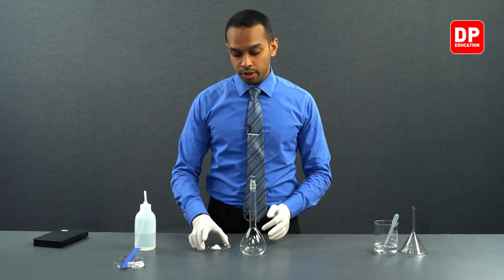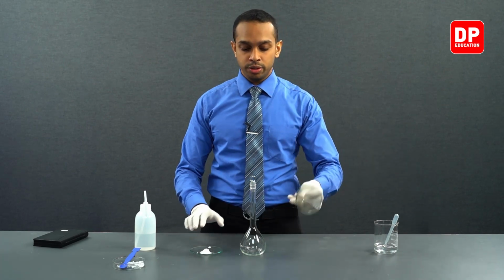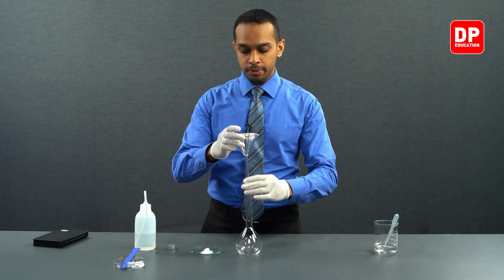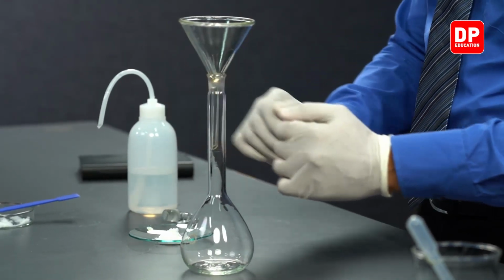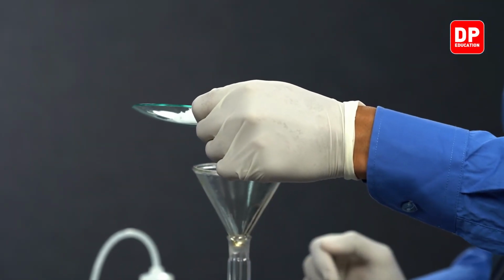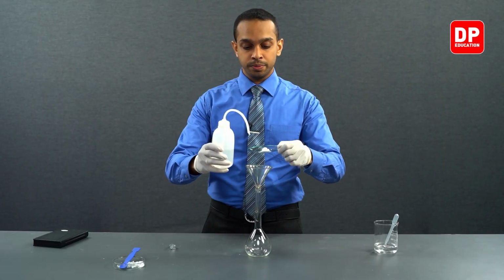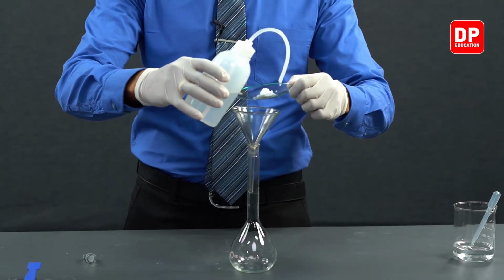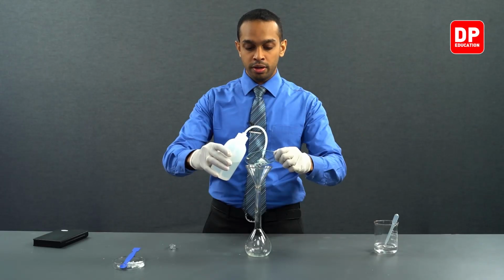To transfer this solid completely onto this volumetric flask, we will be using a funnel. We will open the volumetric flask, remove the stopper, and place the funnel on the volumetric flask like so. And now I will transfer this solid onto the volumetric flask with the use of a wash bottle and some distilled water. So you have to wash the solid onto the funnel, making sure no solid remains on the watch glass.